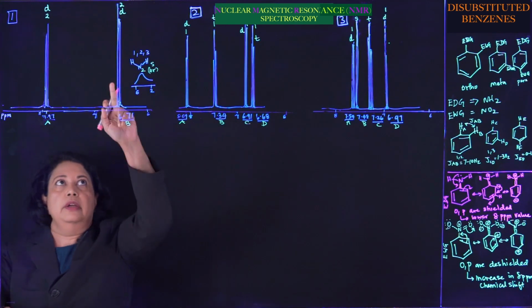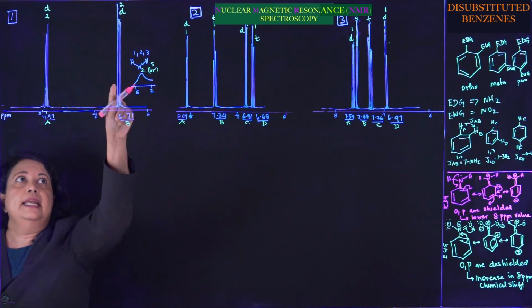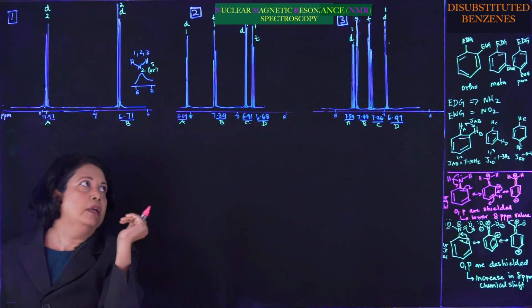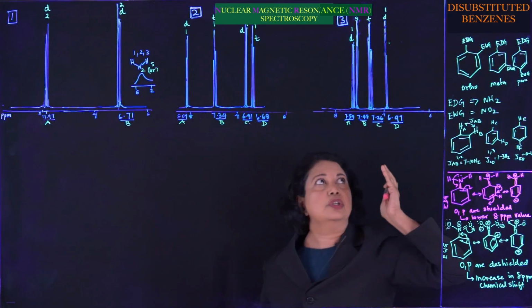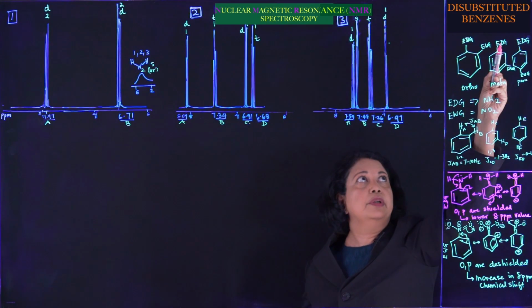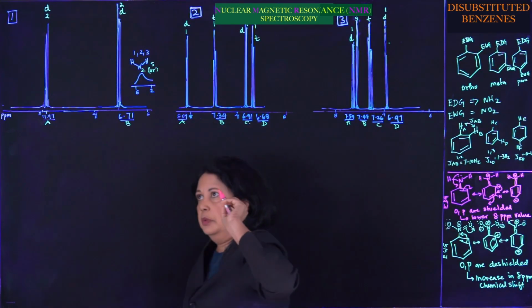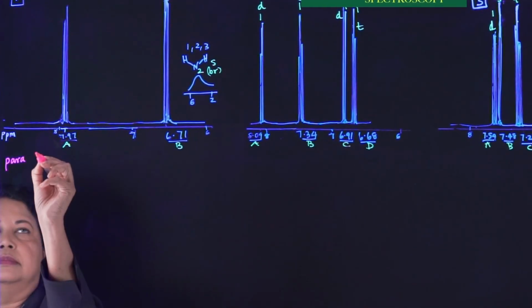So here is a benzene, and you have a doublet, and both of them have 2 hydrogens, which means you're very symmetric. Which one of these do you think can give you a very symmetric structure with just 2 types of hydrogens when you have 2 different groups here? Well, let's try this one and see how that goes. Okay, let's look at para disubstituted.